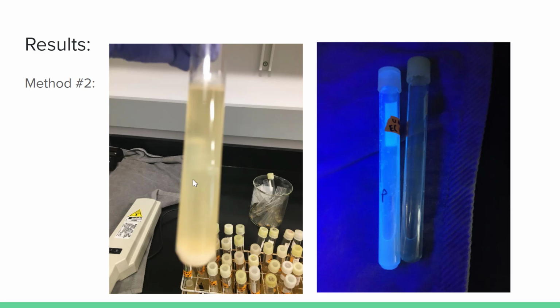The first test tube is fluorescing, and this indicates a positive for E. coli, and the next test tube next to it is just a comparison. This doesn't have any environmental sample, it just contains the broth.